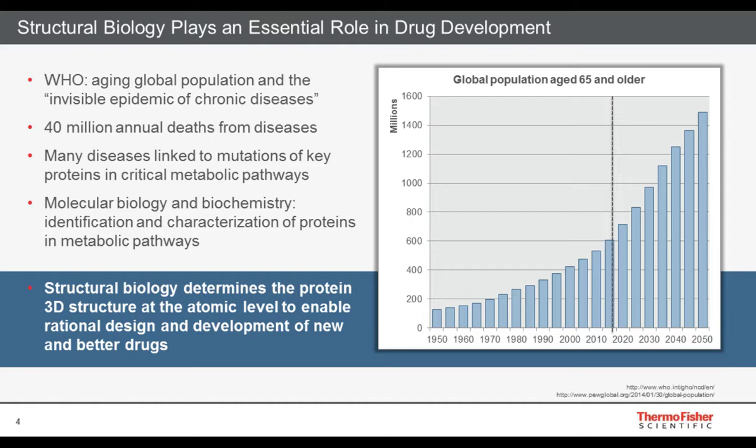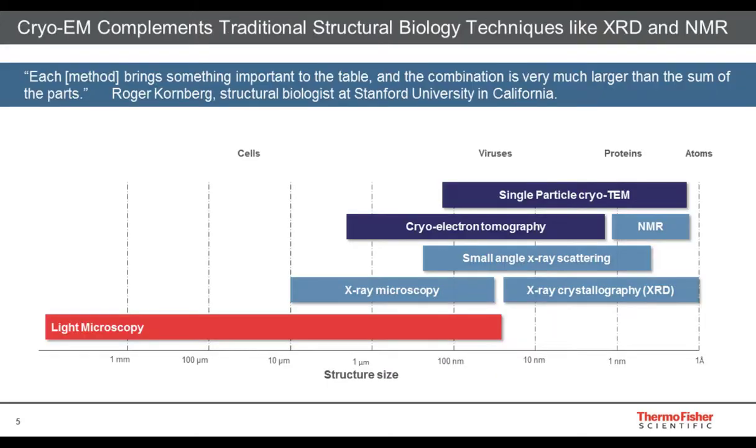And if this is understood, then it can also play a role in the development of new drugs and more efficient drugs in general. And that's basically the driver behind current research in structural biology. If we talk about structural biology, there are a lot of technologies that play a role here, or form part of the structural biology technology base, so to speak.